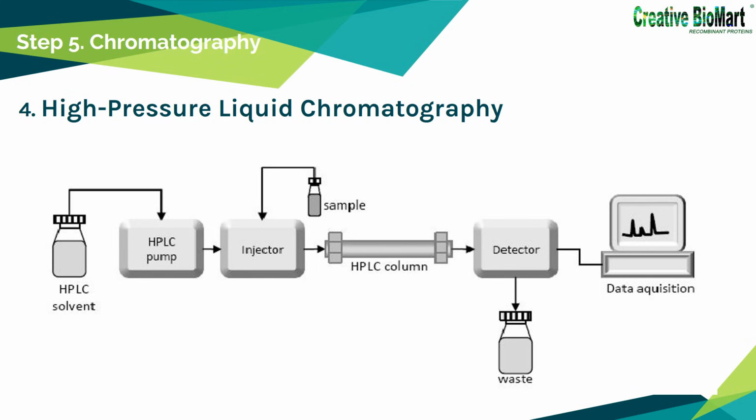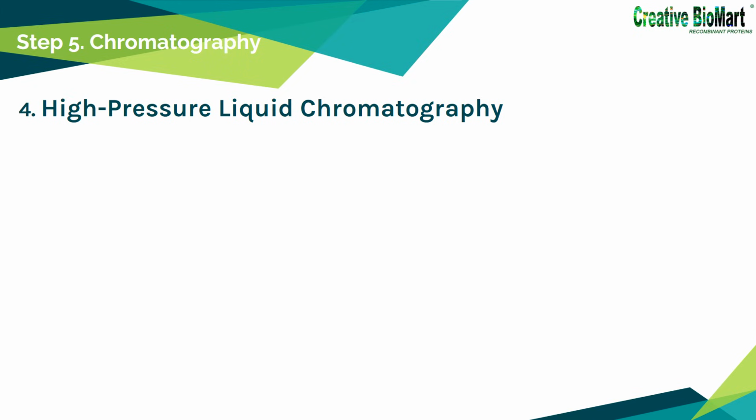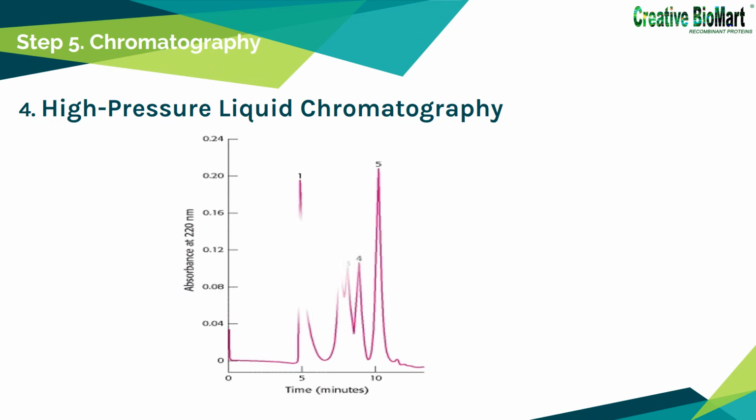When using HPLC, the samples are loaded into the column and move through the stationary phase under pressure. Because different materials have different affinity with the stationary phase, the components leave the column at different times. The detector obtains various peak signals, and each peak represents a different kind of compound. After comparing and analyzing these signals, we will know the material contained in the sample. The net result is high resolution as well as rapid separation.